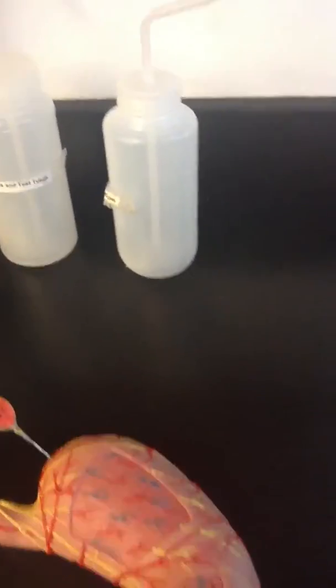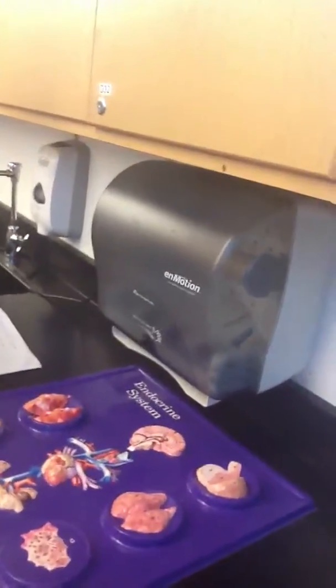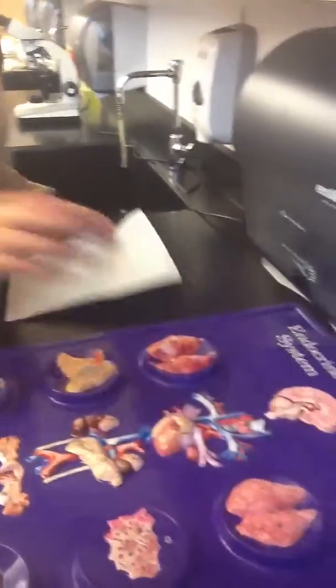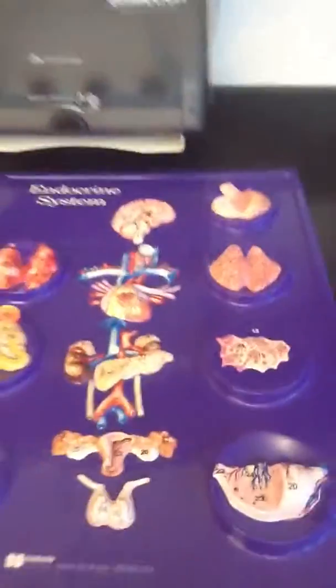53 is the adrenal cortex. 54, parathyroid glands. There's no 54 here, but if they ask you, these are the parathyroid glands. This is the posterior part of the thyroid, this is the anterior part of the thyroid. You will distinguish the parathyroid in the back. Okay, 55 is the ovary, that's the slide.